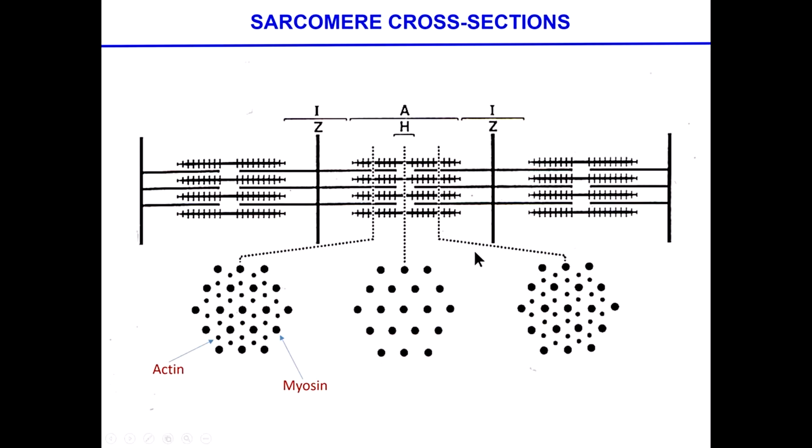All right, so again, to refresh our memories, if we cut through a portion where there are both filaments, we're going to find these kinds of structures on either side. And if we cut through this one, we're going to see just the myosin by itself. If we were to cut, and that is not shown in this scheme, through the I band around there, we would see a picture like this, but all with thin filaments, as opposed to the thick ones. Okay? Questions?